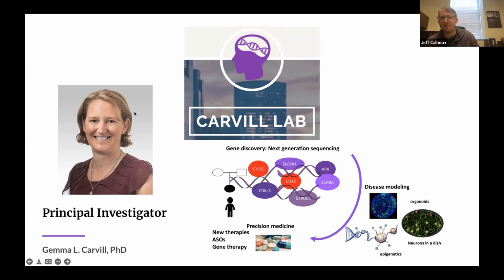So the biggest problem is just getting enough cells back. So say I transfect 10 million and that's what I take to the flow sorter. I rarely get more than 200,000 cells back in an individual cell pool. So trying to scale that up to do thousands of variants and make sure that each variant gets represented by, I don't know, this is what I'm still trying to learn, like how many cells you need per variant. Just seems a little tricky, but hopefully we'll get there. We're definitely planning on it. It seems like you're well on your way.